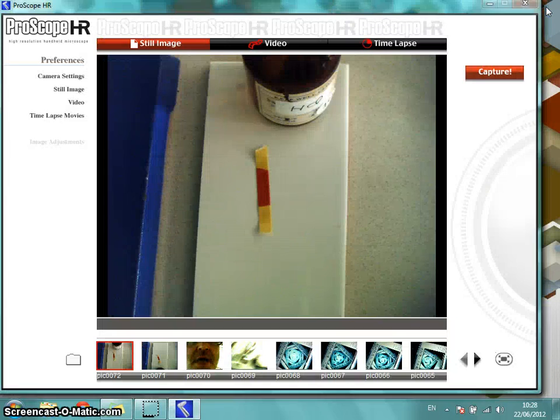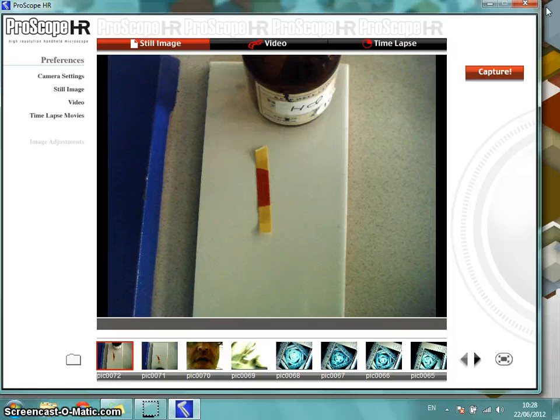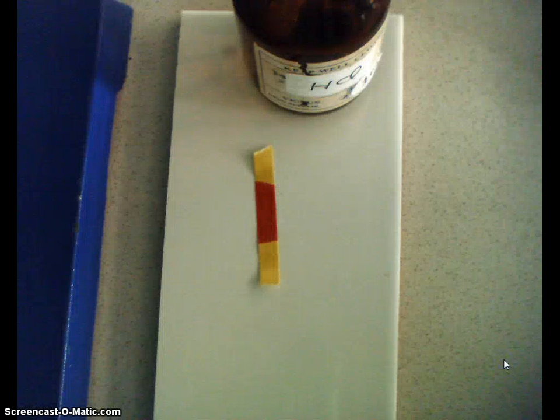One last thing with the camera: there is a button for switching it on. You switch it to A or B. A means that the light in the camera is off. B means that the light is switched on, and the software just adjusts to the different lighting conditions automatically — that's something you need to play around with. Last but not least, you can maximise and go into a whole screen.